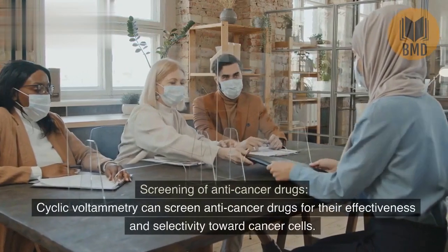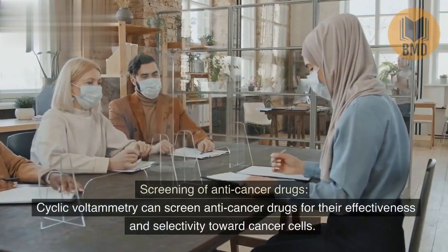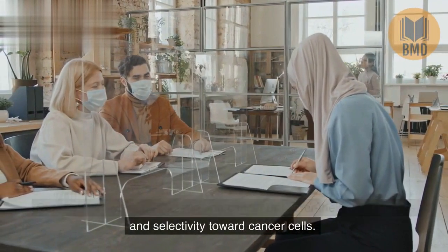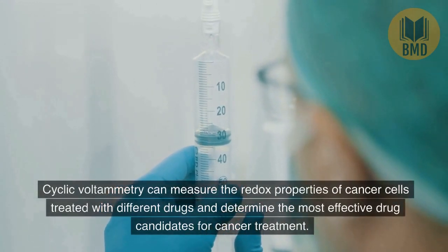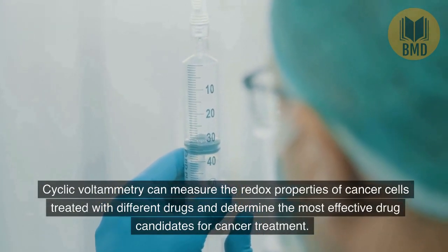Screening of anti-cancer drugs. Cyclic voltammetry can screen anti-cancer drugs for their effectiveness and selectivity toward cancer cells. Cyclic voltammetry can measure the redox properties of cancer cells treated with different drugs and determine the most effective drug candidates for cancer treatment.